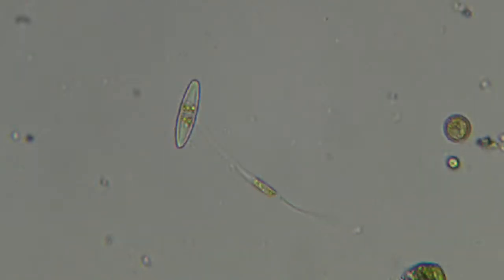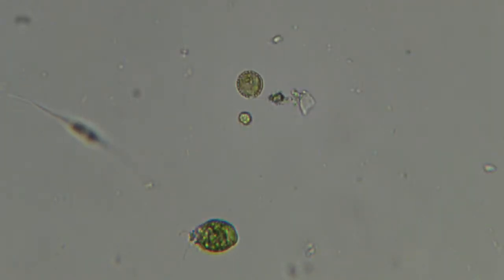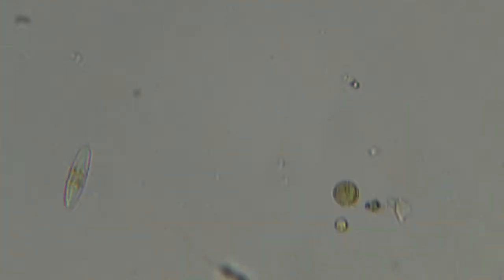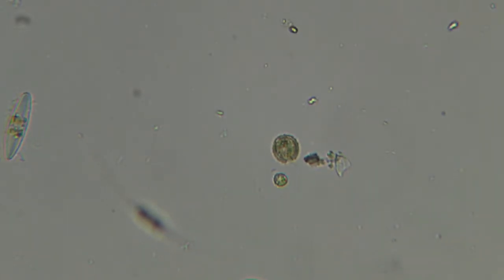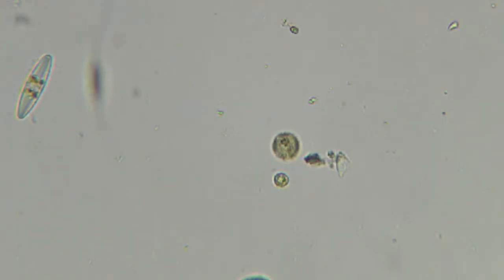What else we got in here? Some more little single cell plants. Some chlorella, probably. That little round one with the studs on the outer membrane, I have no idea what that is, but you can really see the cilia going crazy on that one. It's making it do that wiggle as the cilia, the flagella are pumping away.